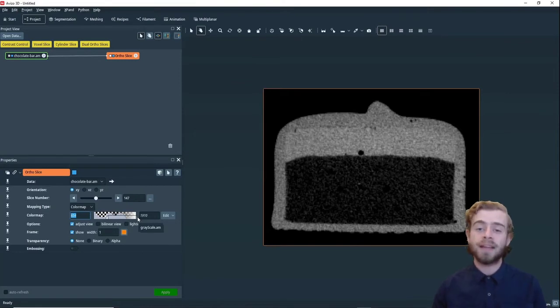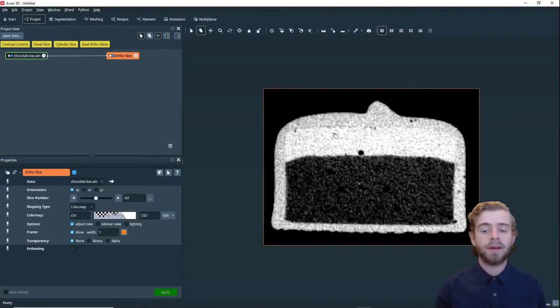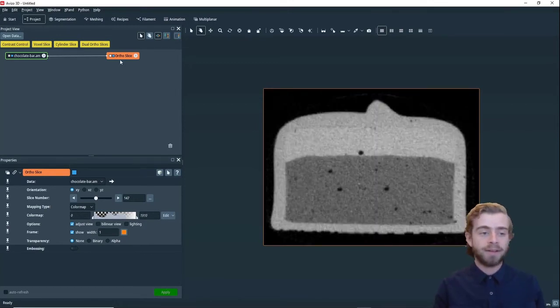So if we want to make the image more white, we can move the top value down and we can see how it makes more of the values white.